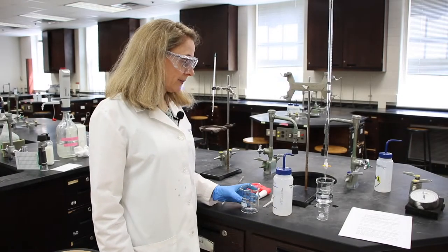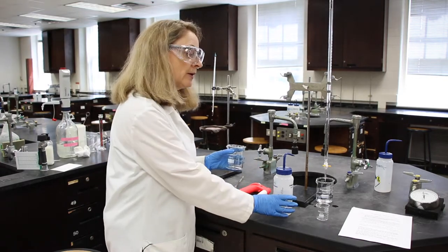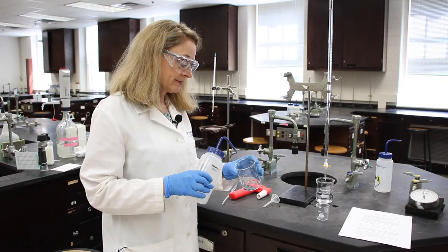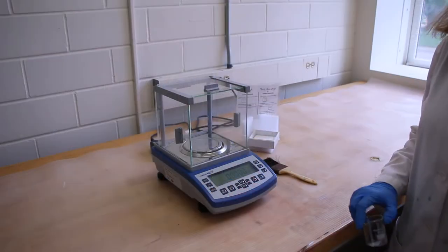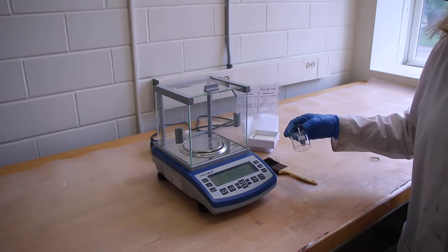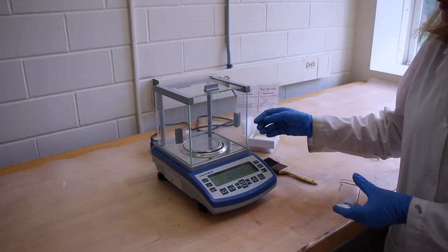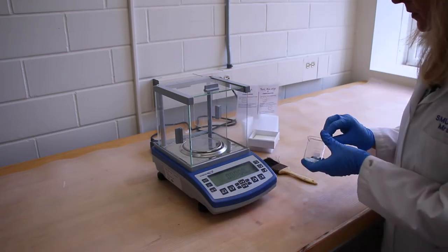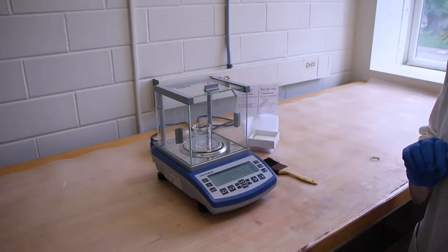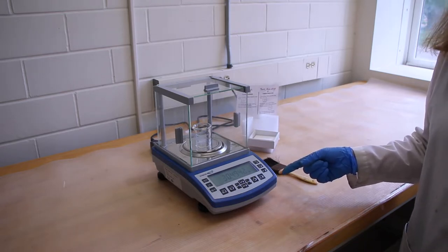Our next step in the procedure says to fill a clean 250 milliliter beaker with about 100 milliliters of DI water. The next step says to weigh a clean and dry 50 milliliter beaker. The balance reads zero. I'm going to open the door, place the beaker on the pan, and close the door. Can you please read and record this in the data sheet?